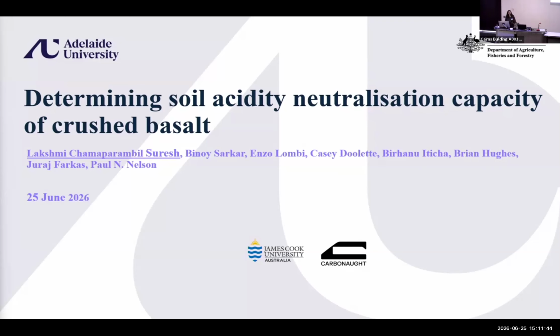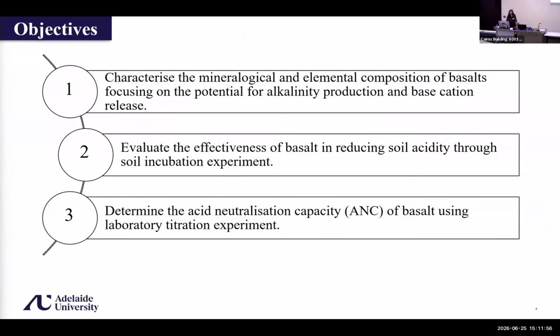So good afternoon, everyone. Today I'm going to present on the topic: determining soil acidity neutralization capacity of crushed basalt. This is a small experiment that is part of my PhD work, and it consists of three objectives. First, to characterize the mineralogy and elemental composition of basalts, focusing on the potential for alkalinity production and base cation release. Second, to evaluate the effectiveness of basalt in reducing soil acidity through a soil incubation experiment. And third, to determine the acid neutralization capacity of basalt using a laboratory titration experiment.